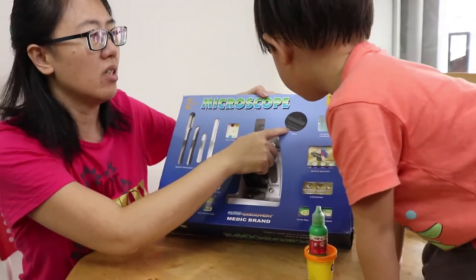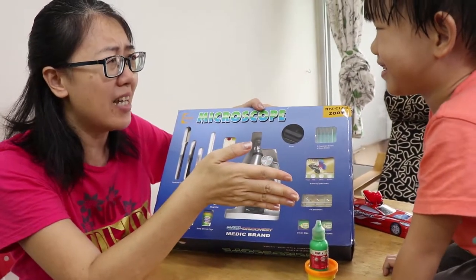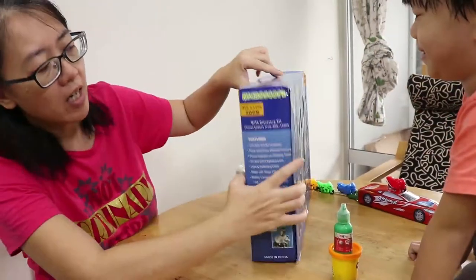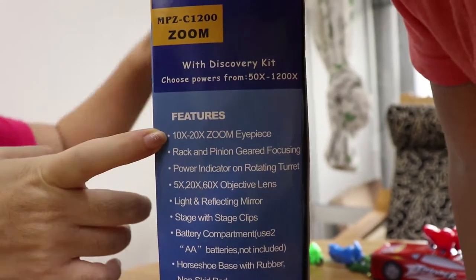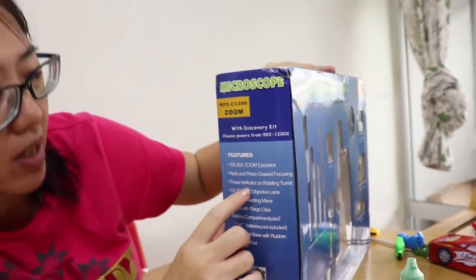There's also a slicer. What does a slicer do — slice insects? I'm too scared to slice insects. What are the features of this microscope? It has a 10 to 20 times zoom eyepiece. And rack and pinion geared focusing — I have no idea what that means.